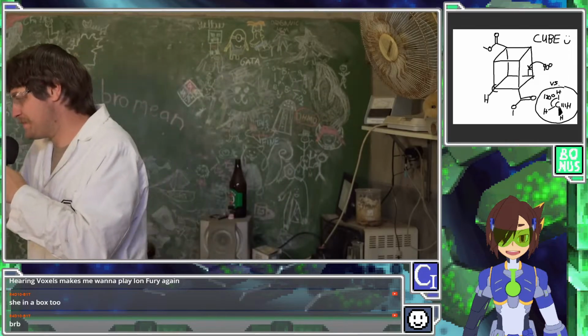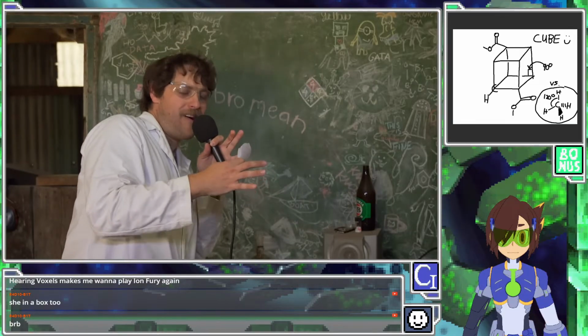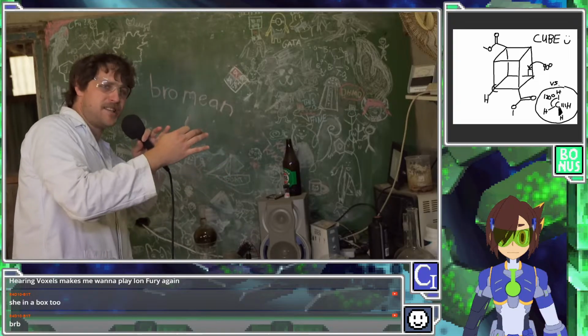Can't you just hit it with the size enlarging gun? It'll make it bigger. This is the biggest cubane scale I think we can manage. I have some new 2-liter flasks, so we're going to be running this in a 2-liter.